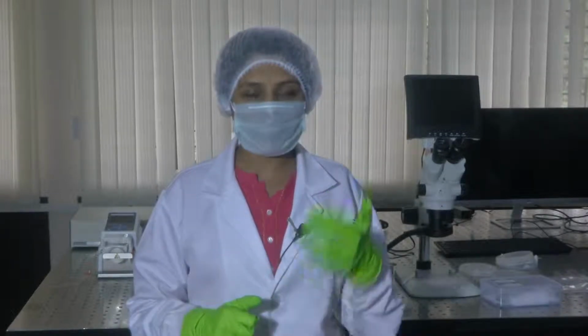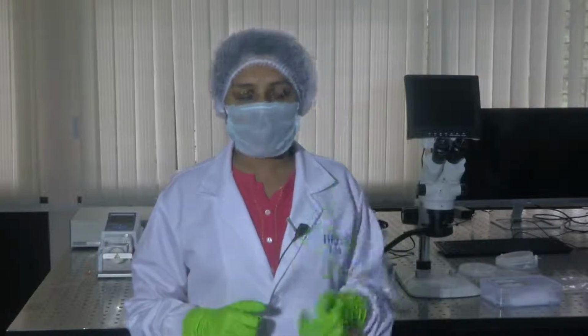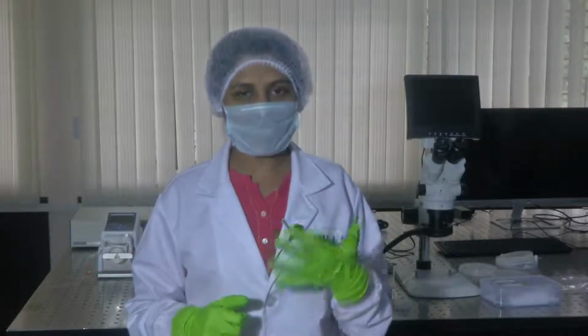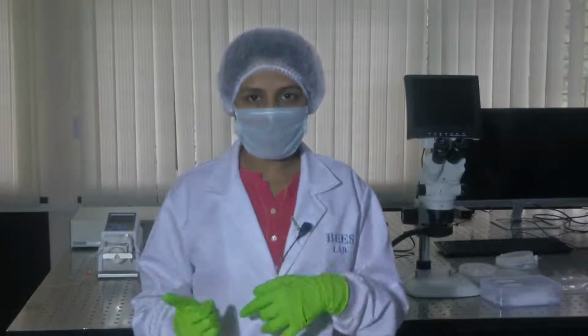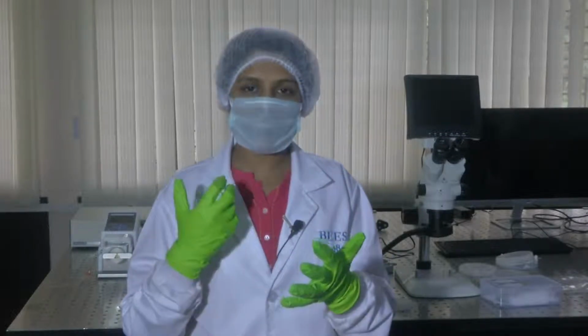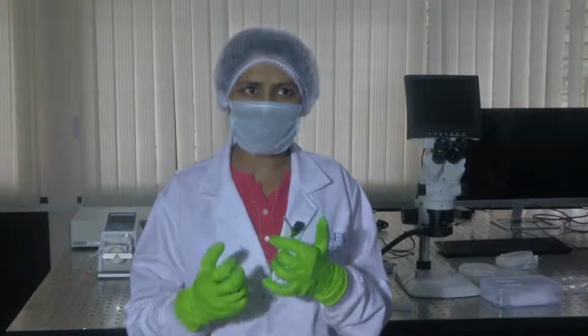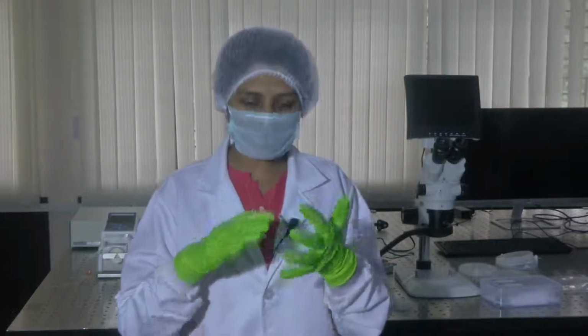So all of this could be achieved using peristaltic pumps. There are two variations in peristaltic pump. One is the tube pump, the other one is the hose pump. The hose pumps are mostly designed for high pressure operation. The peristaltic pump that we would be using is designed for low pressure operation.